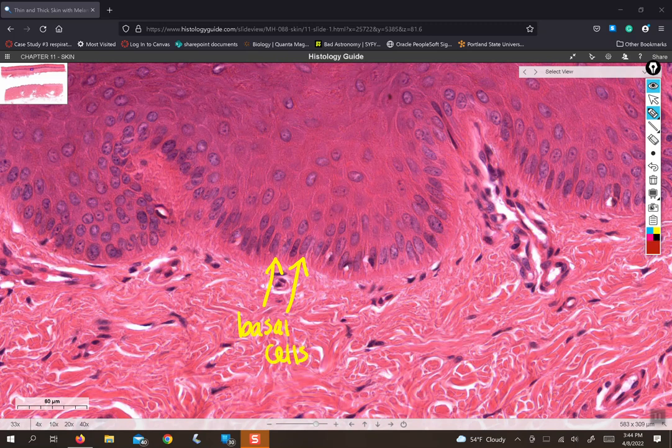This one's a really nice one. So is this. Those are melanocytes. When you are scrolling through the stratum germinativum and you come across a cell with a little white space next to it, those are going to be melanocytes. So the stratum germinativum consists of basal cells interspersed with melanocytes.